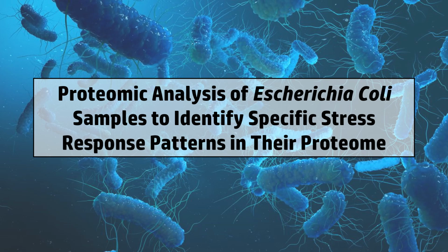Now this video is an accumulation of all the things we learned throughout the semester and their eventual conclusion. At the beginning of the semester we were given two sets of samples. One was the control, which was grown under normal circumstances, and one was the treated. Both of these samples were E. coli samples. The goal was to find out what happened to those treated samples by analyzing their proteome. This was done by traditional tools and techniques associated with proteomic-based analysis. Now let's get to it.